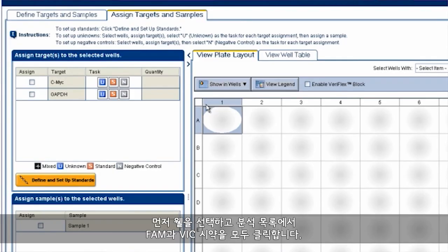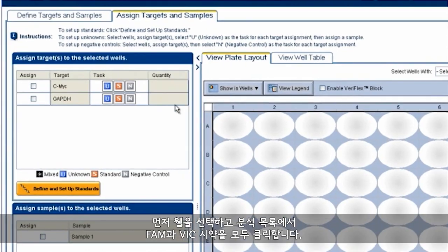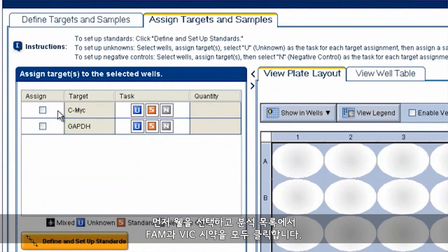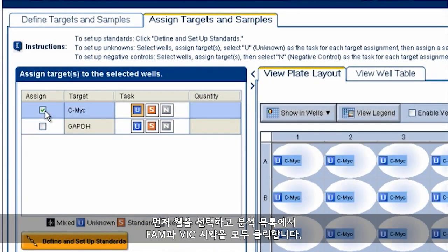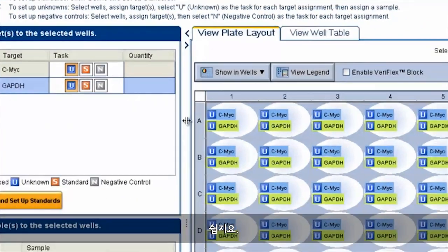Which any Life Technologies instrument can distinguish. To set up a plate of multiplexing in any real-time software, just select your wells, then go over to your list of assays and click on both the FAM and VIC targets. Easy!